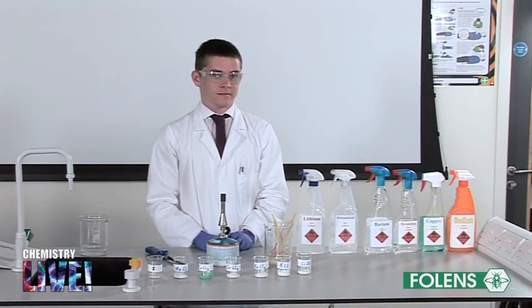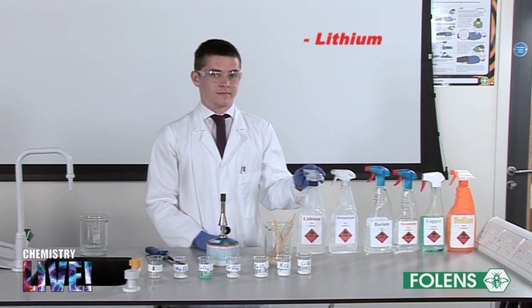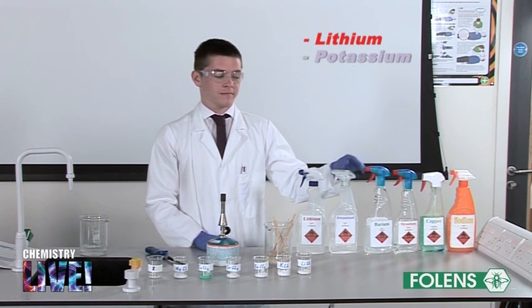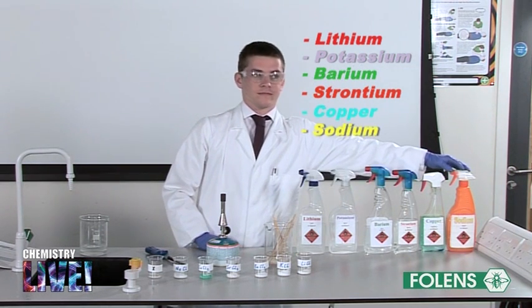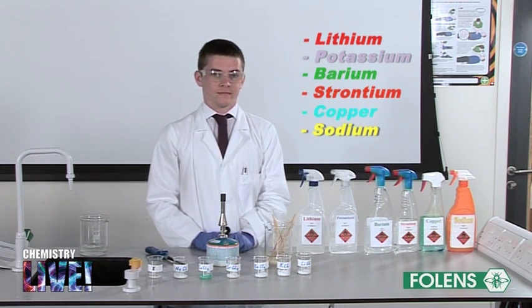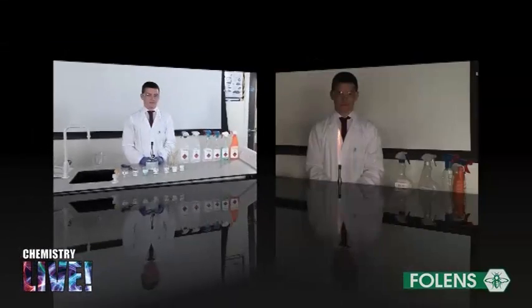The above colors can also be demonstrated using samples of the salt dissolved in a mixture of alcohol and water. We have lithium, potassium, barium, strontium, copper, and sodium. We see that we get the same colors. To see these colors better, we view this in the dark.